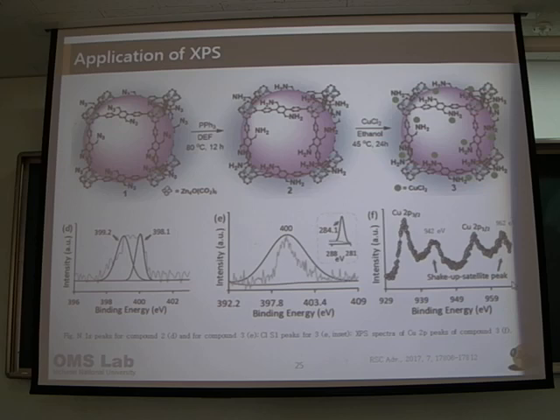Hold on. You added copper 2. And if the copper chloride is bound to the amine, then what kind of difference do you expect? This time, when this copper chloride binds with amine, this is the coordination, the metal and amine coordination.